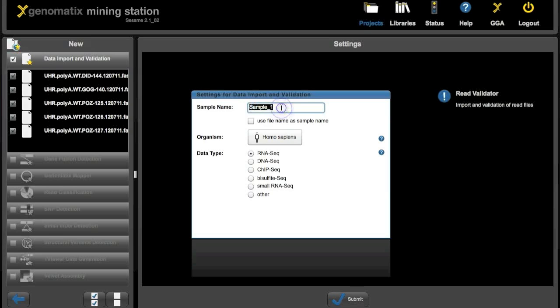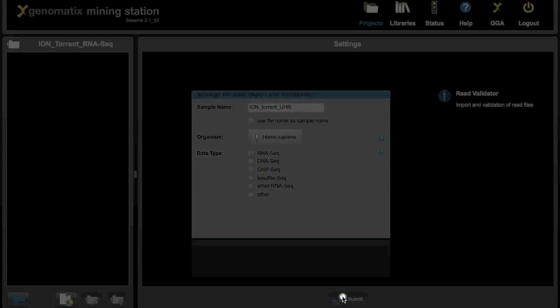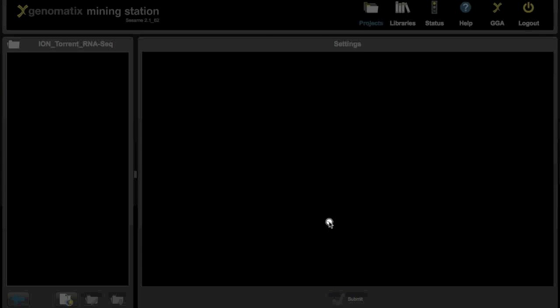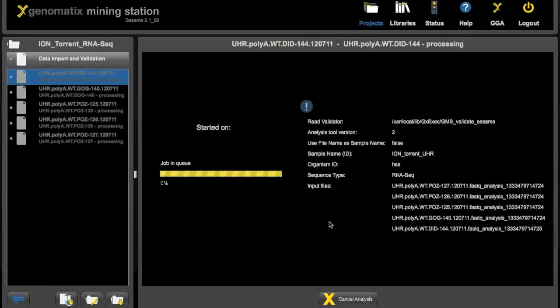Where we can give a sample name. We choose Ion Torrent UHR for universal human reference here. Then we click on the submit button down here, and the import gets started.